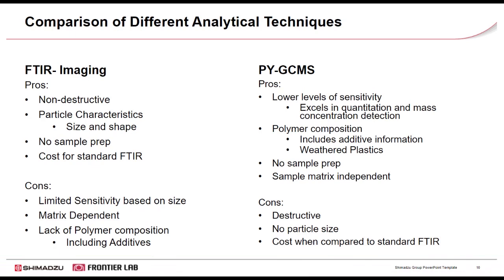In addition to the more accurate concentration at lower levels, the morphology of microplastics leads to complications using spectroscopy due to the smaller size, shape, and color of some potentially translucent polymers or additives. And finally, microplastics sampled from various ecosystems have almost always been subjected to some form of weathering. Weathering changes the composition of pure polymers, making them possibly difficult to identify.